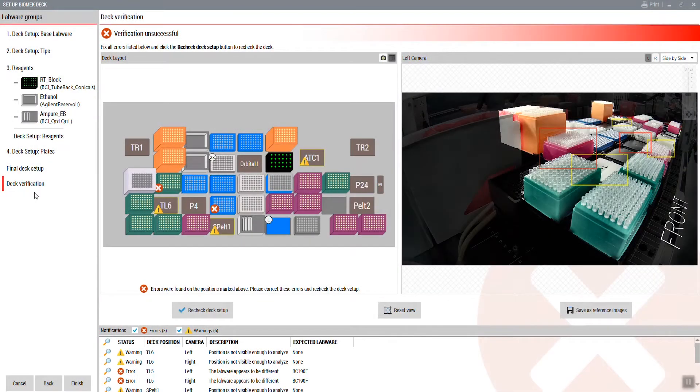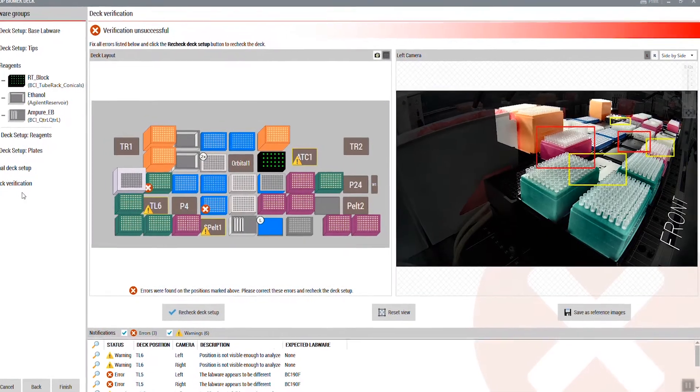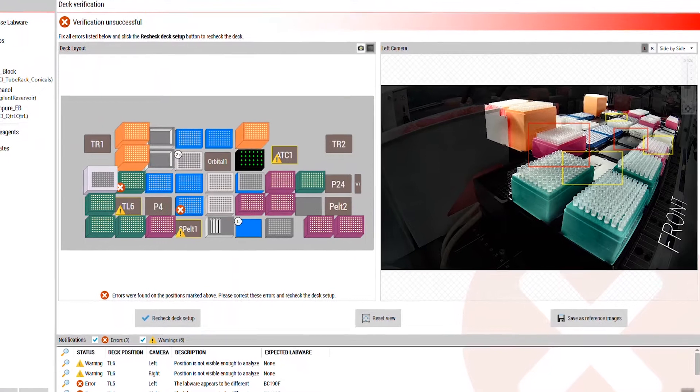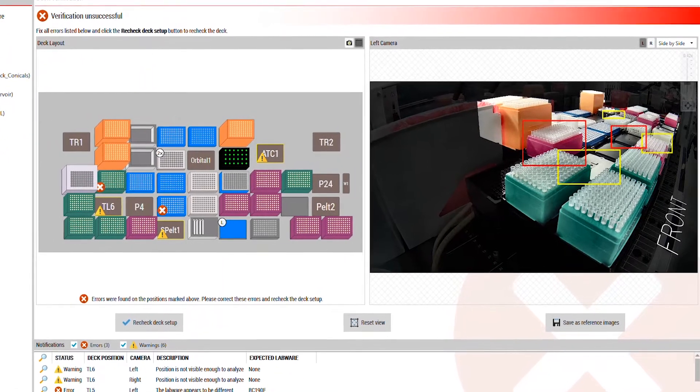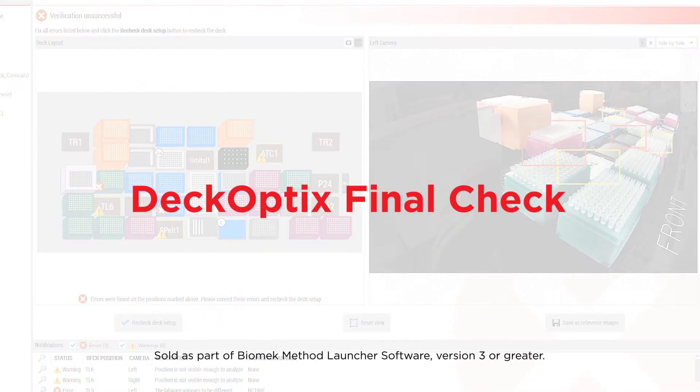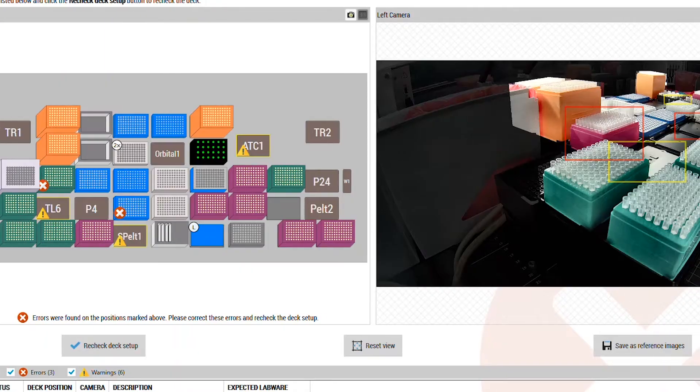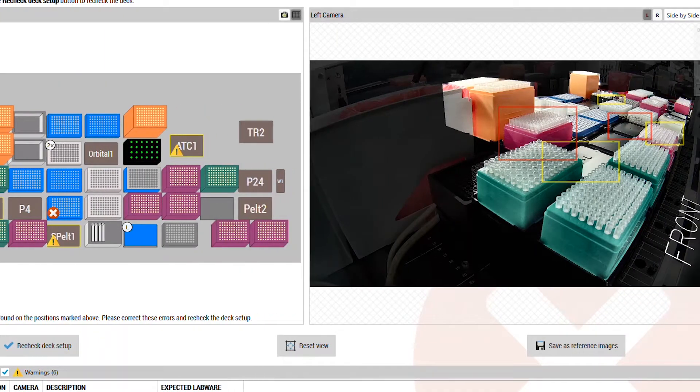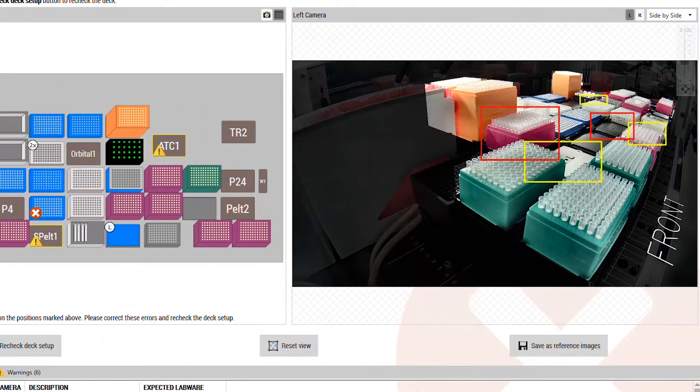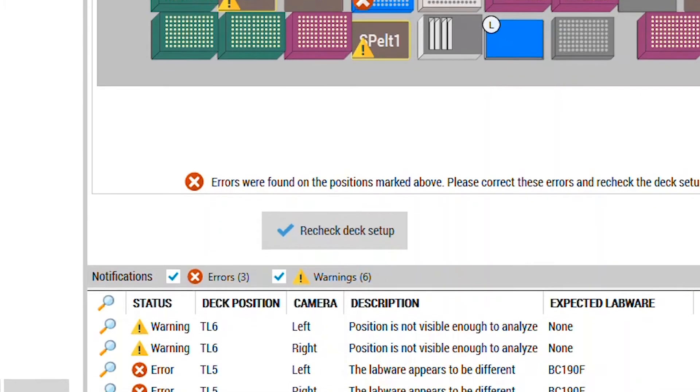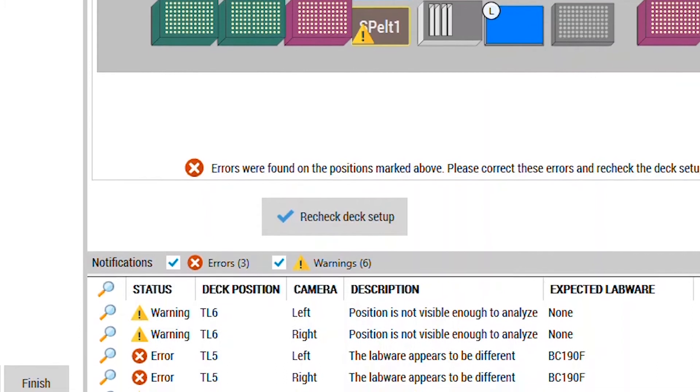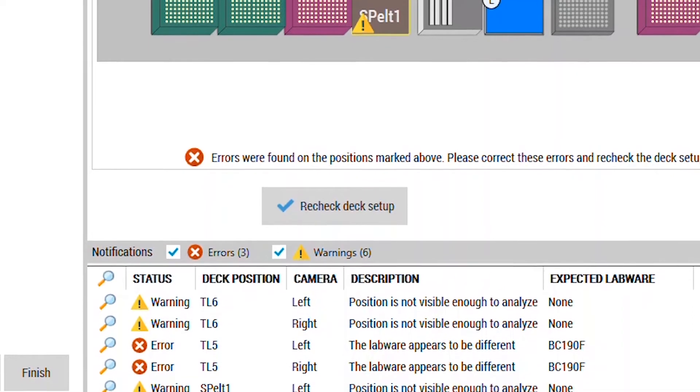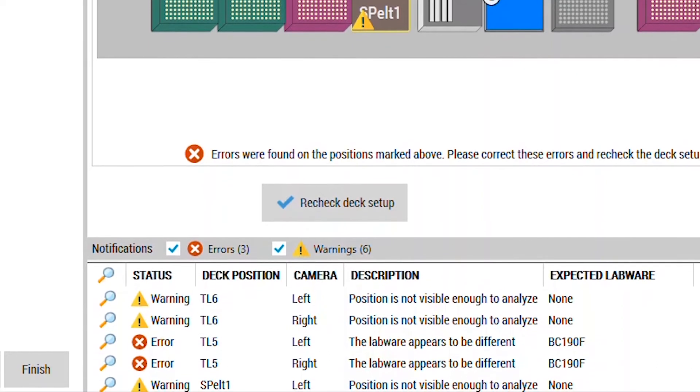Fortunately, there is a fast and easy way to avoid costly deck setup errors. DeckOptics' Final Check software from Beckman Coulter Life Sciences analyzes the labware placed on the Biomek deck for common errors and alerts you prior to the start of the run, helping you avoid costly errors.